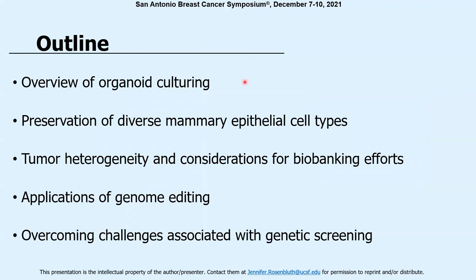Today, I will give an overview of organoids and their ability to preserve diverse cell types, touch on a few considerations for biobanking efforts, and discuss genome editing and genetic screening applications.